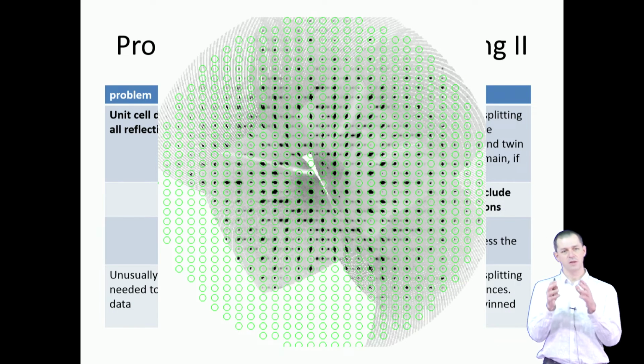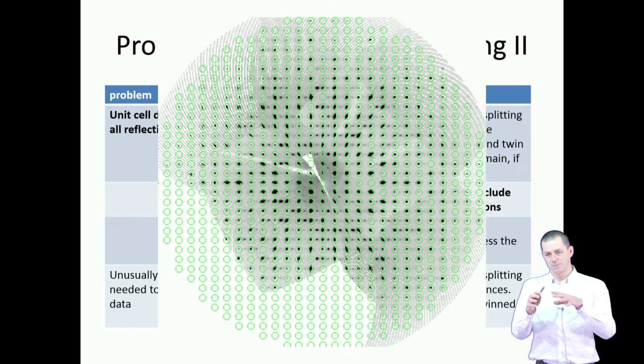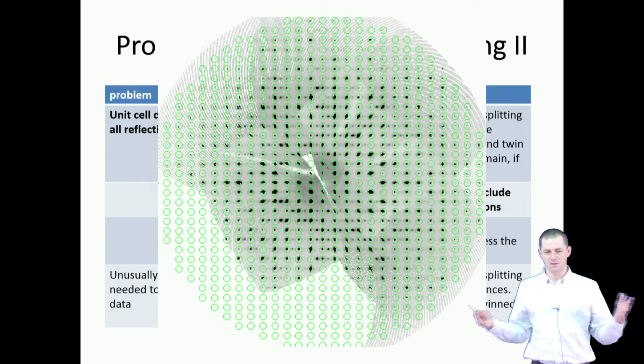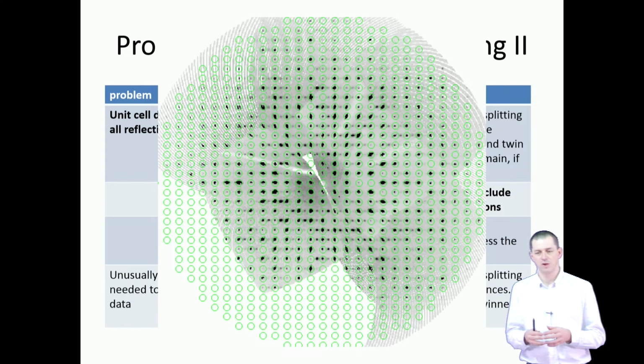And then, based on that unit cell, the diffractometer collected all the reflections corresponding to this unit cell. So you can imagine that if only a supercell in reciprocal space was found, so weak signals were missed, then the data collection didn't include them at all, and you didn't have a chance to realize that you missed some weak signals.